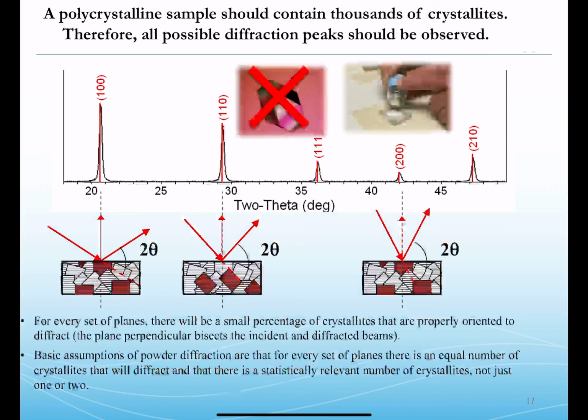To solve this problem, engineers and scientists will often granulate their sample, make a powder out of it. This helps create a layered material full of many tiny crystals that are randomly scattered throughout all options in their orientation in the layer of sample, as you sort of see depicted here. So this could be the same sample just ground up, made into a powder. And this allows us to reposition random pieces of crystals throughout the sample.